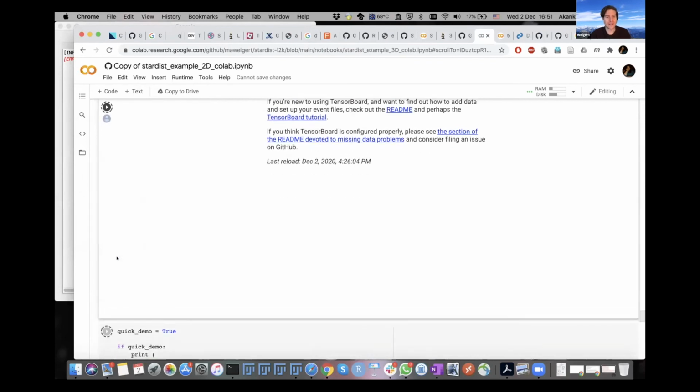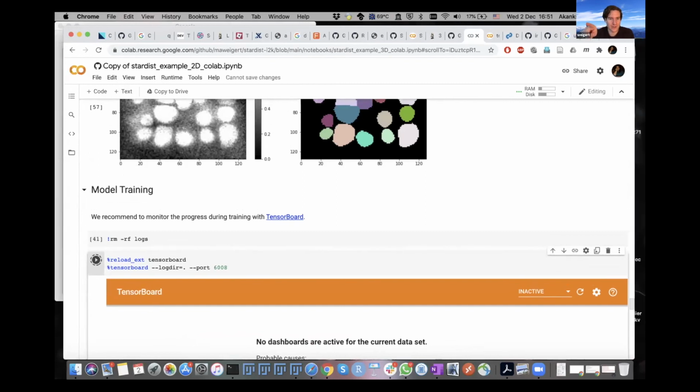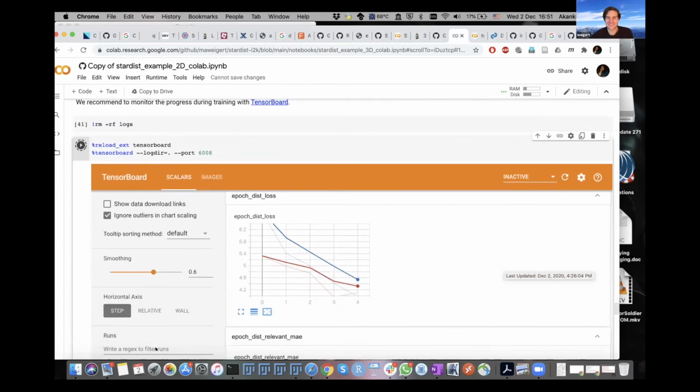Okay, if you go up again, and now go to the refresh button that is on the right, this little circle with an arrow within this TensorBoard GUI. This one. Okay. Yeah, hooray. Cool, cool. Thank you.